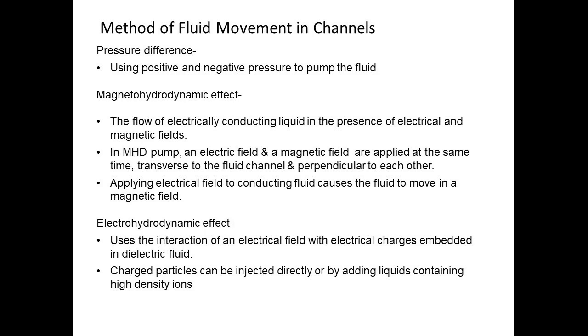The third point is the electrohydrodynamic effect. It means something to do with electricity and also the liquid. It uses the interaction of an electrical field with electrical charges embedded in the fluid. The charged particles are injected directly or by adding liquids containing high density ions. So by having this, you can control the fluid in the channels by manipulating the high density ions embedded in the fluid.